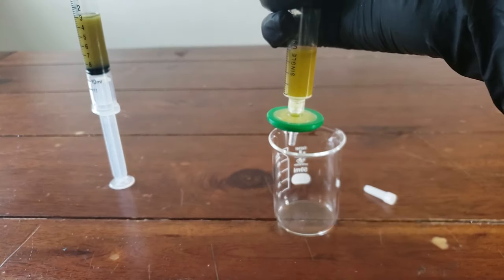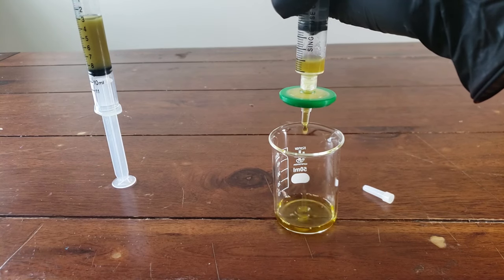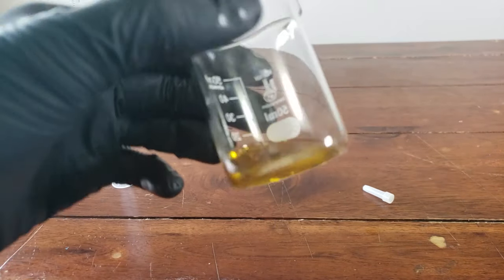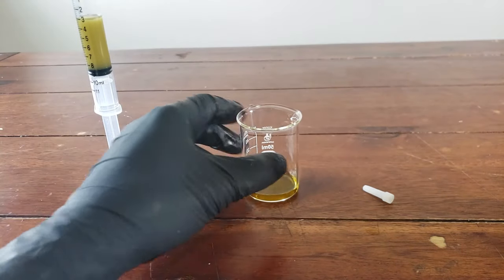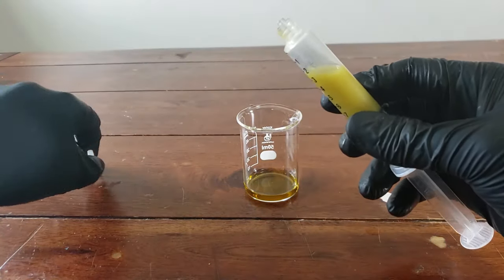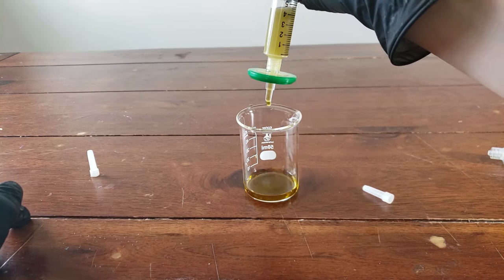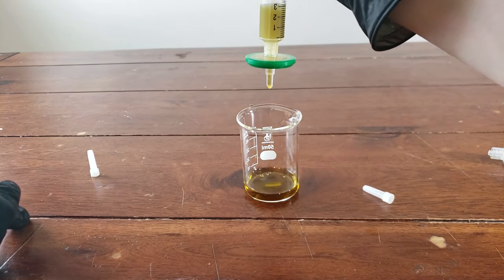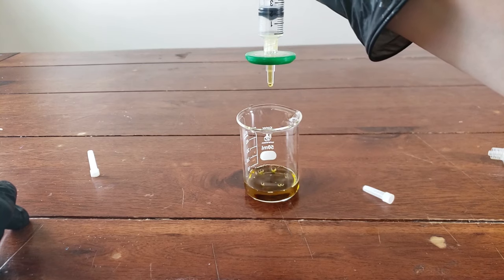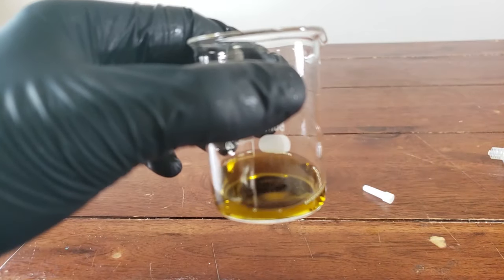Here I'm pushing them through a 0.22 micron syringe filter. The syringe filter traps the fats and waxes and removes them from the alcohol. In the end, you have rosin and alcohol that has been winterized and removed of any of its fats and waxes.